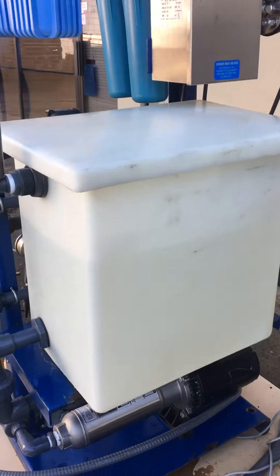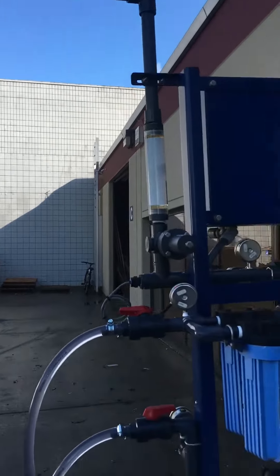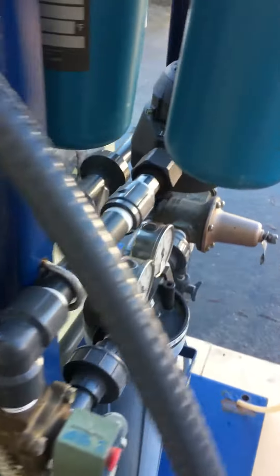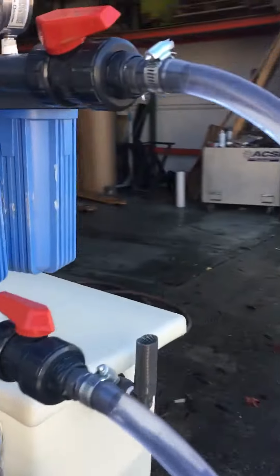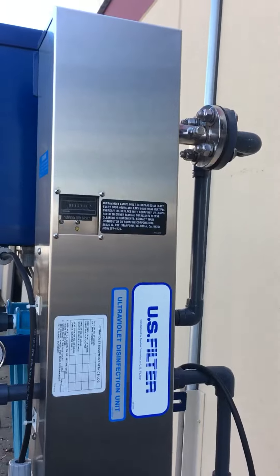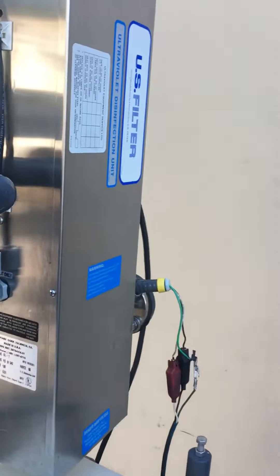You can kind of see the water level going down. This unit also has the UV sterilizer — it has a brand new bulb in there and it does work.